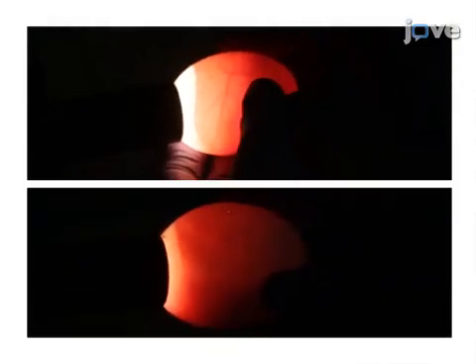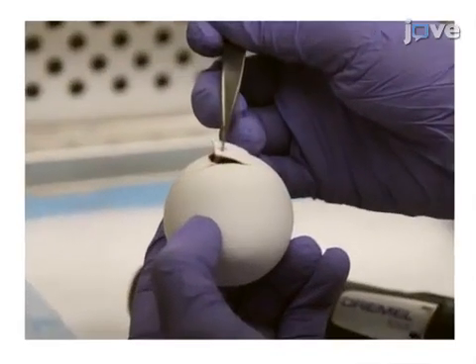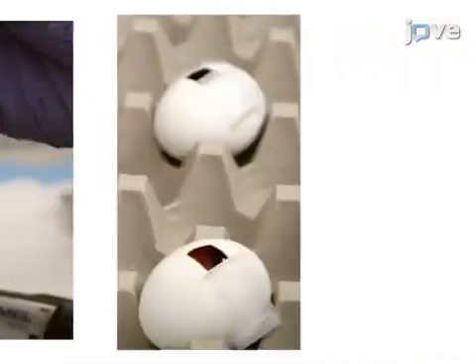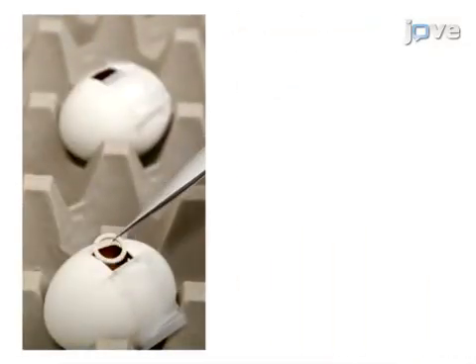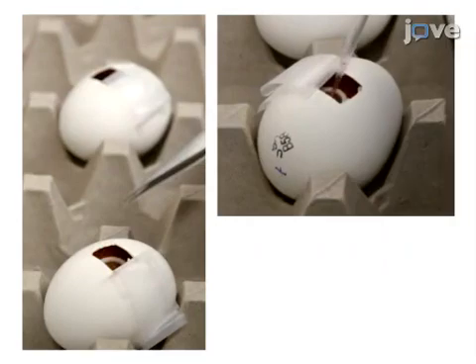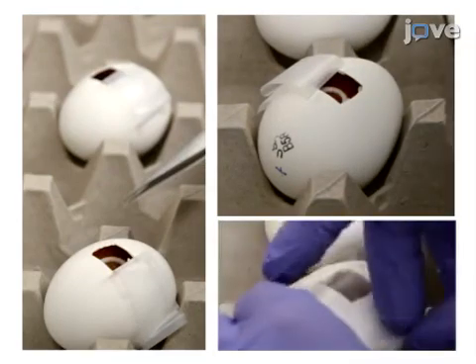As a second step, the chorioallantoic membrane, or the CAM, of the egg is dropped, and a window is cut into the eggshell. Next, the egg is inoculated with human hepatocellular carcinoma cells through the eggshell window in order to establish tumor growth.